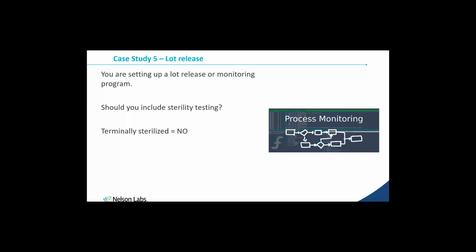I'm going to do a test that is on the verification dose product. So is sterility testing going to be involved? Yes. Is sterility testing on terminally sterilized product going to be involved? No, as we see on the screen. Well, if it's aseptic processing, if it's a pharmaceutical, yes, I am doing sterility testing on that in accordance with the United States Pharmacopoeia or my applicable national pharmacopoeia. So there are certainly places where sterility testing, yes, I'm going to do it.